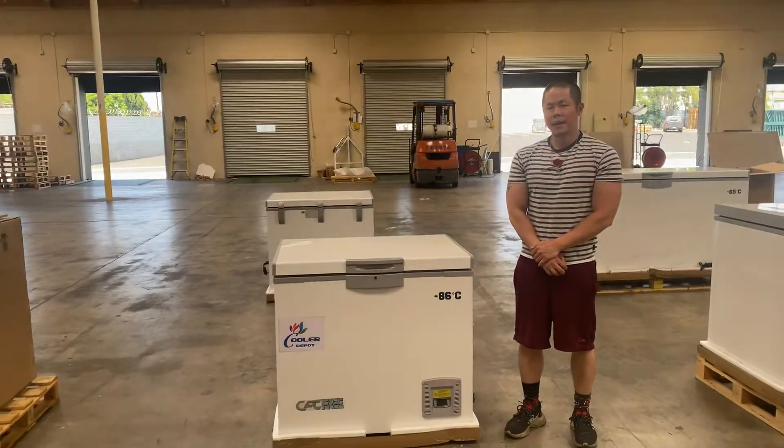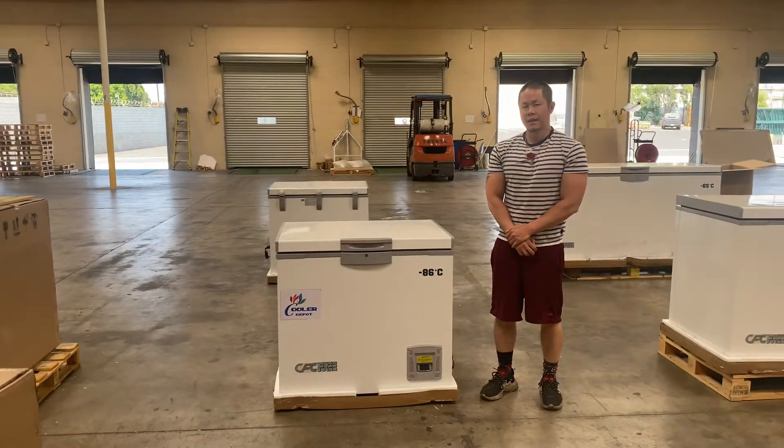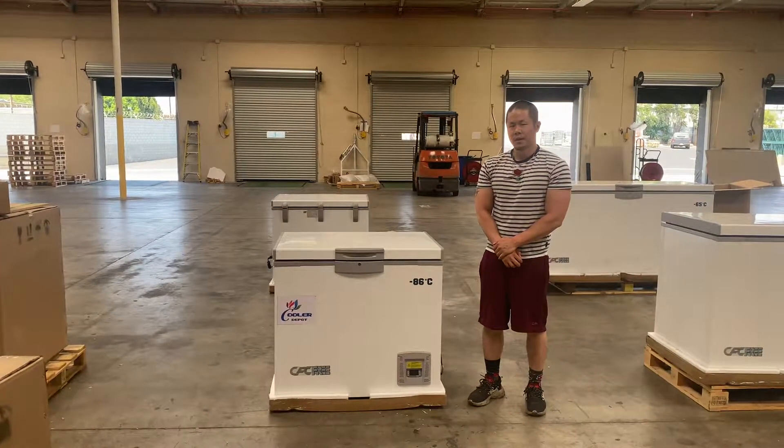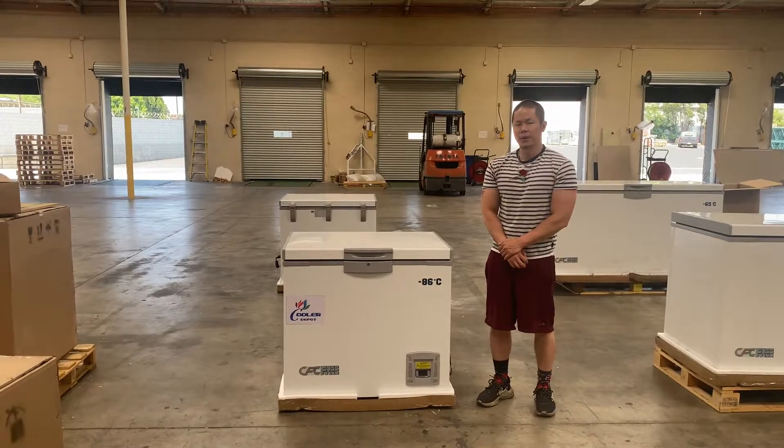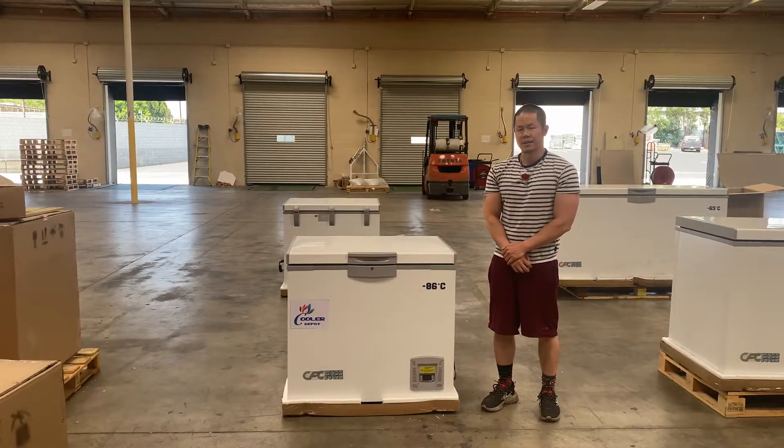Again, this is our negative 86 degrees Celsius vaccine medicinal storage chest freezer. For any questions, please give us a call or visit our website at coolerdepotusa.com and we can assist. Thank you.